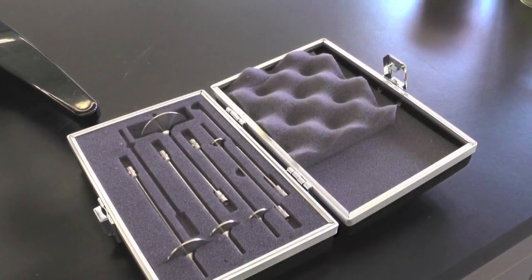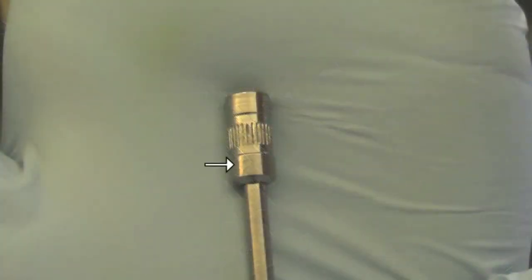The viscometer in the F&H teaching lab comes with a set of 5 spindles. The size number is engraved on each spindle. You can start with a spindle of any size and make adjustments according to the viscosity readings.